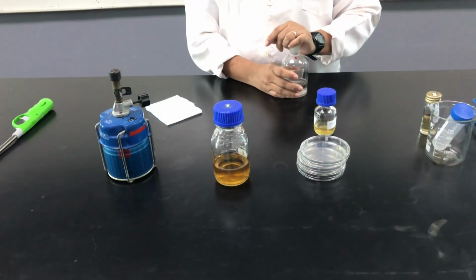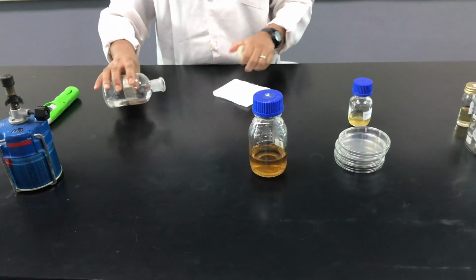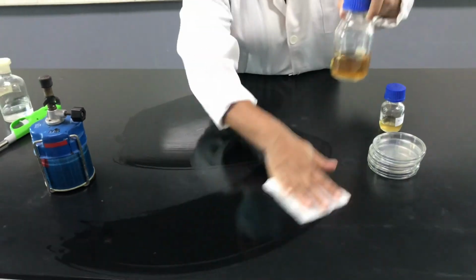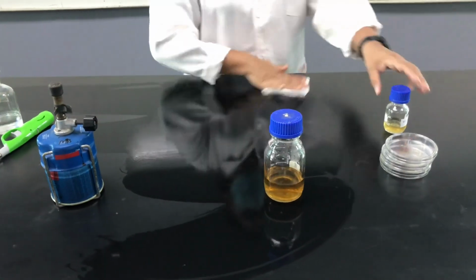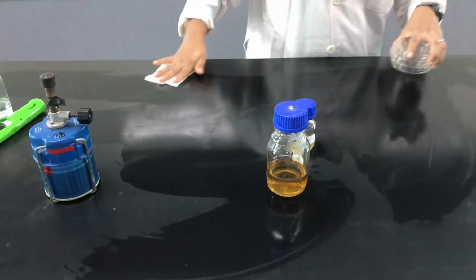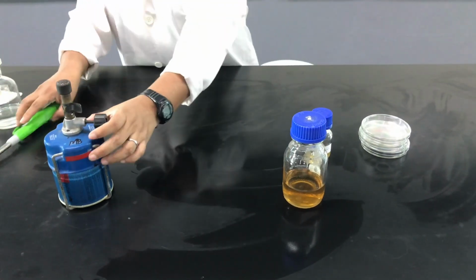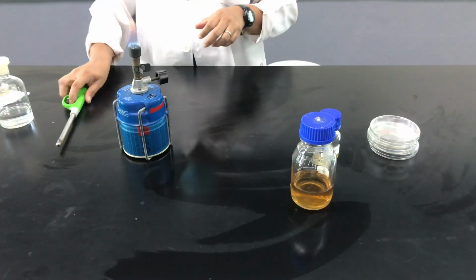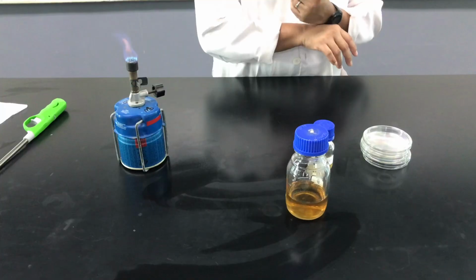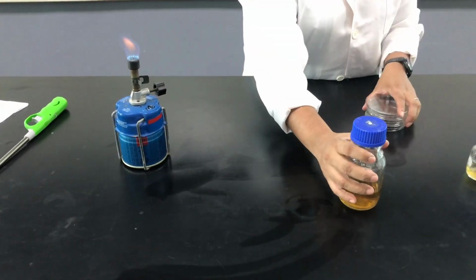Okay class, before we start, let's practice our aseptic technique, where we clean our working bench with methylated spirit or alcohol. This is a normal process. Once this is done, we put up the Bunsen burner to create a sterile condition around your workstation so nothing is contaminated.